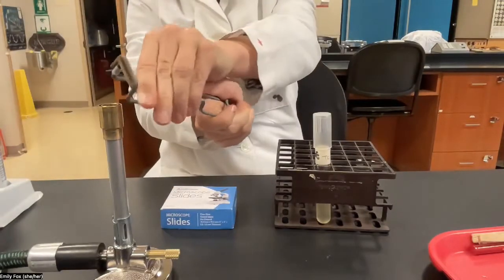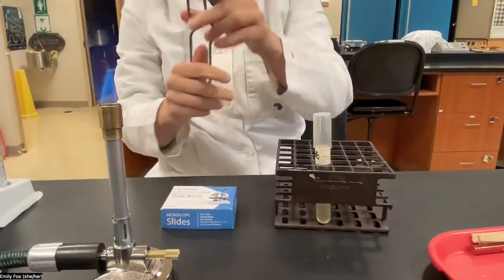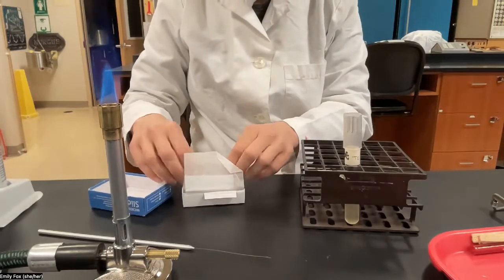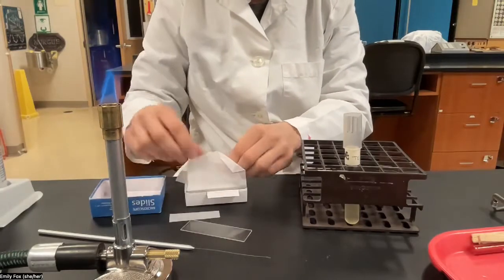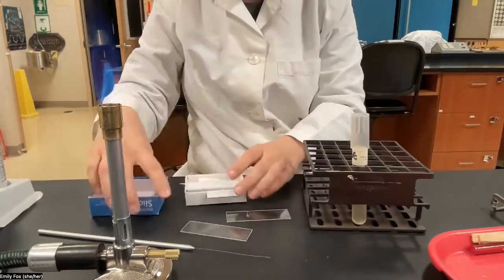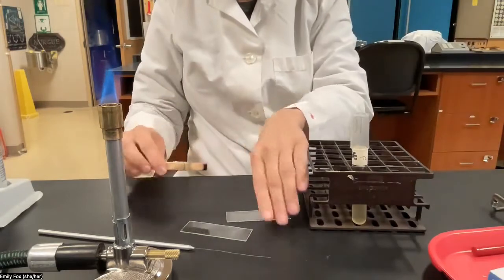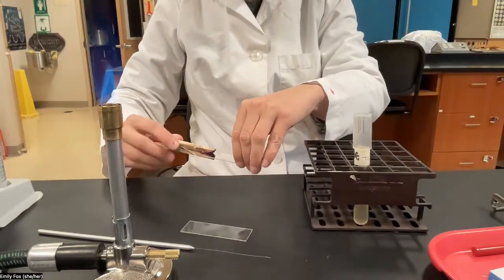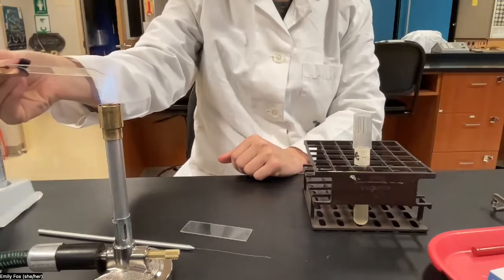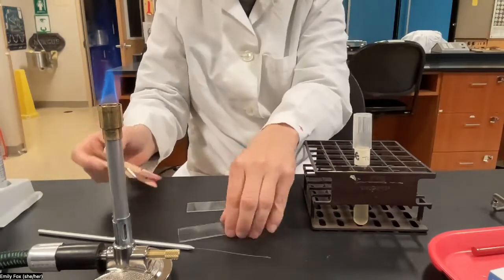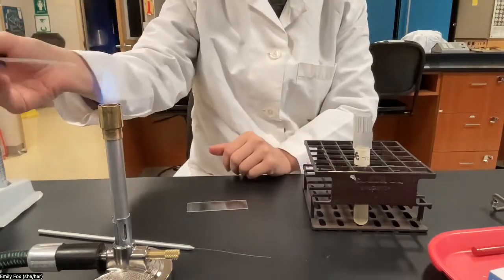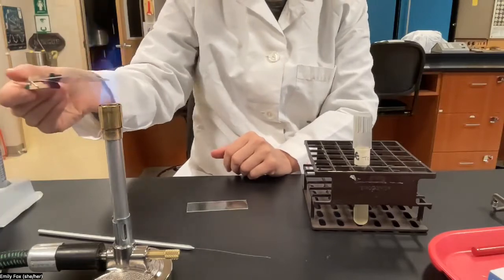Light the Bunsen burner. We're going to make two slides of bacteria for Gram staining. The first thing we're going to do is just degrease the slides. Make sure that they don't have any oils on them, will help our wax crayon stick a little bit better. Just pass it through the flame on each side to degrease.